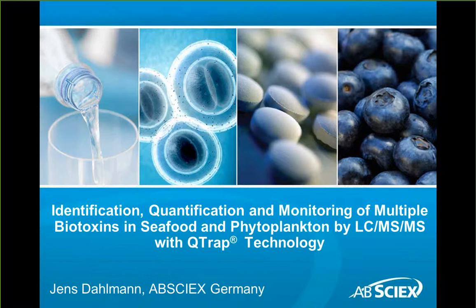And I would like to continue a little bit the analysis of toxins. We keep a strong focus on biotoxins. That means toxins produced by natural organisms such as phytoplankton. However, we are going to move from the land into the sea, and we are going to speak about marine biotoxins. Biotoxins that can be of concern, for example, if you're a seafood consumer, like myself, eating blue mussels.